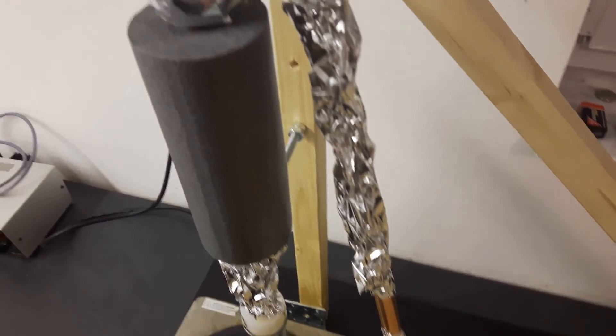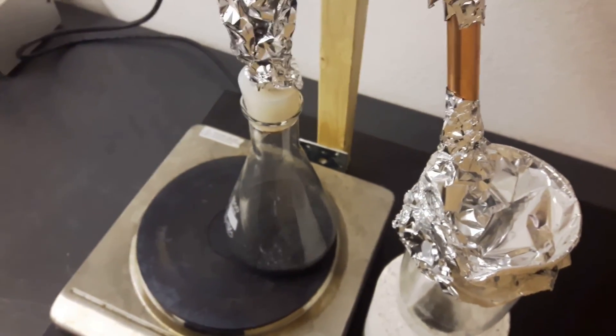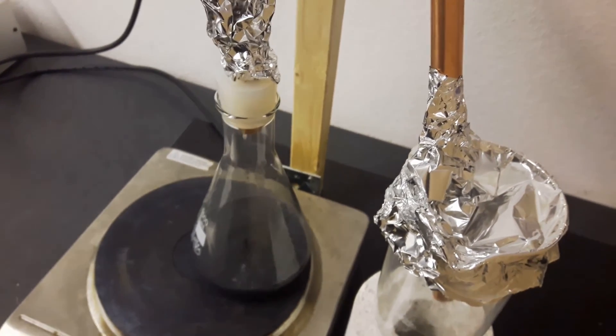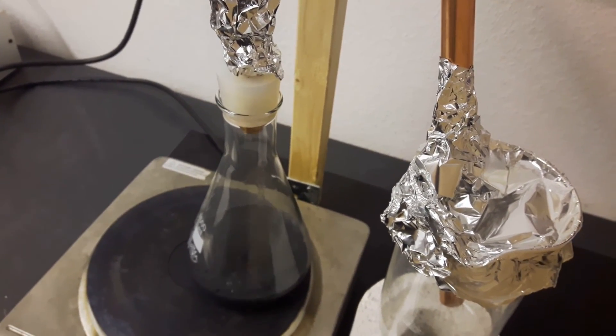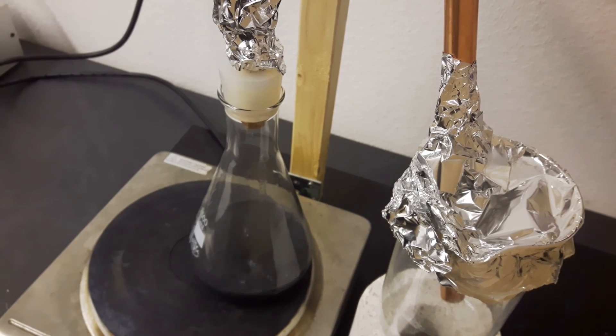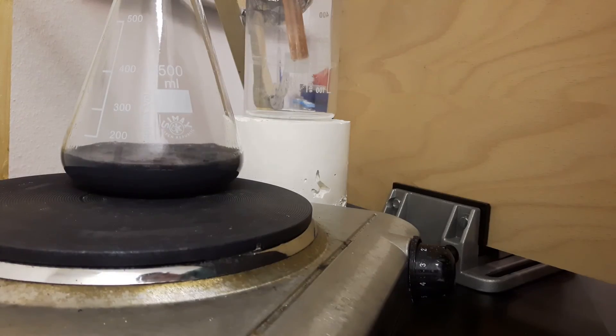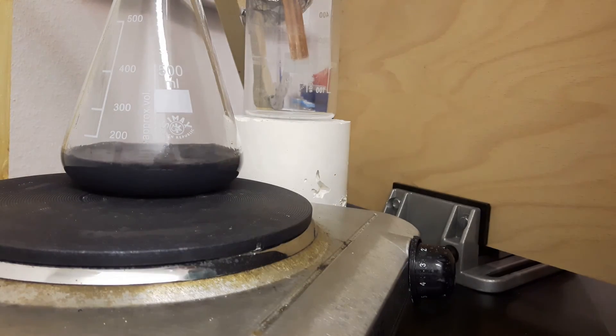So here you see my distillation setup. I've put a thermometer in top. And you see that it's room temperature. So there is not any vapor that has made it up yet. And you see most of the vapor that is going upwards is just dripping down. But soon this will heat up. And here you can see the first isopropanol that is coming over.